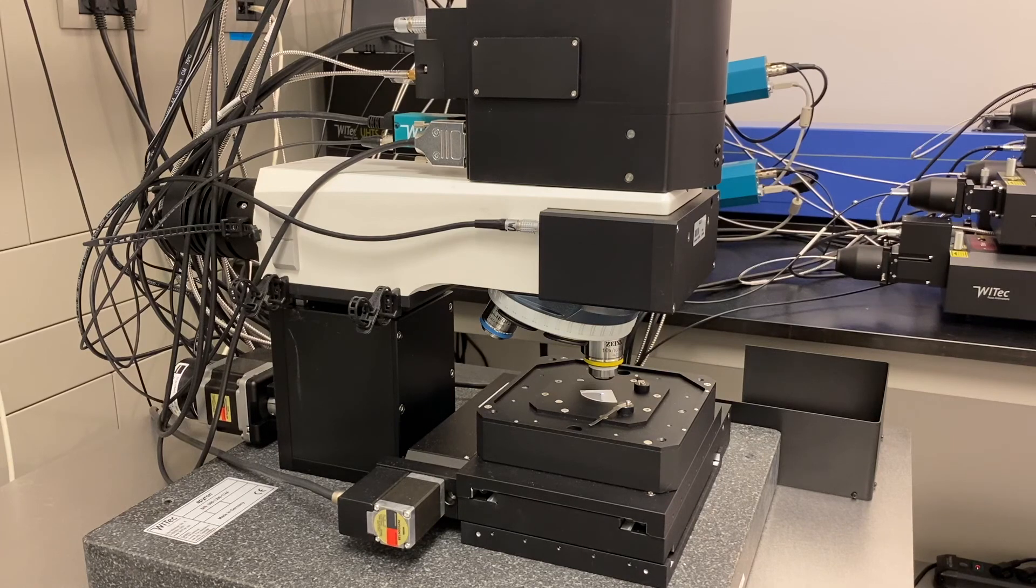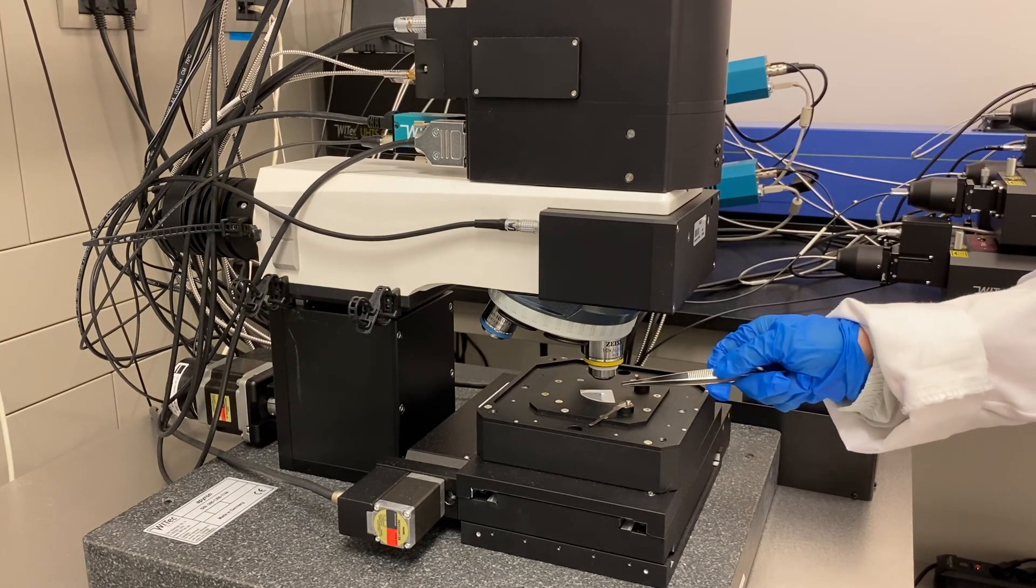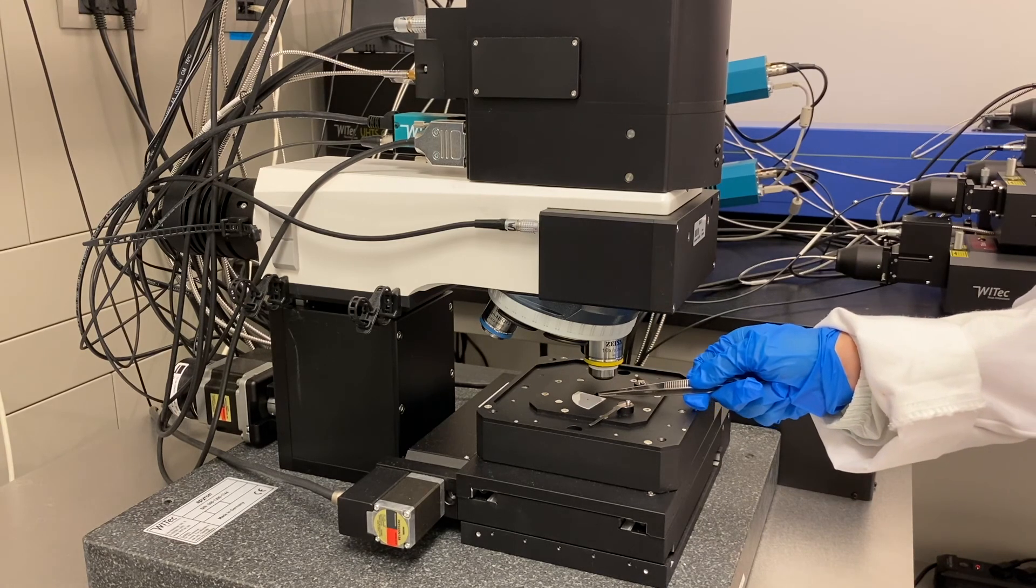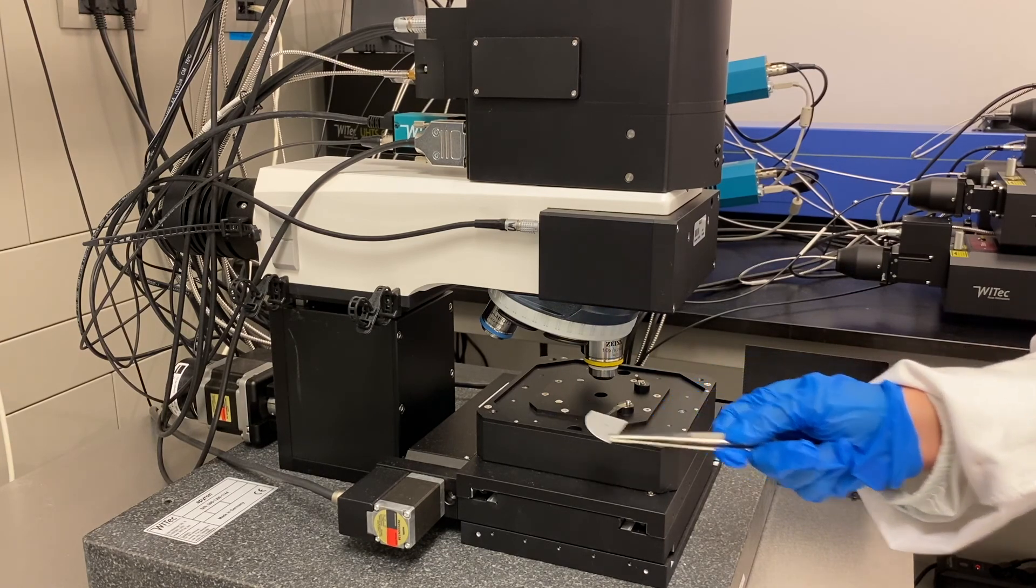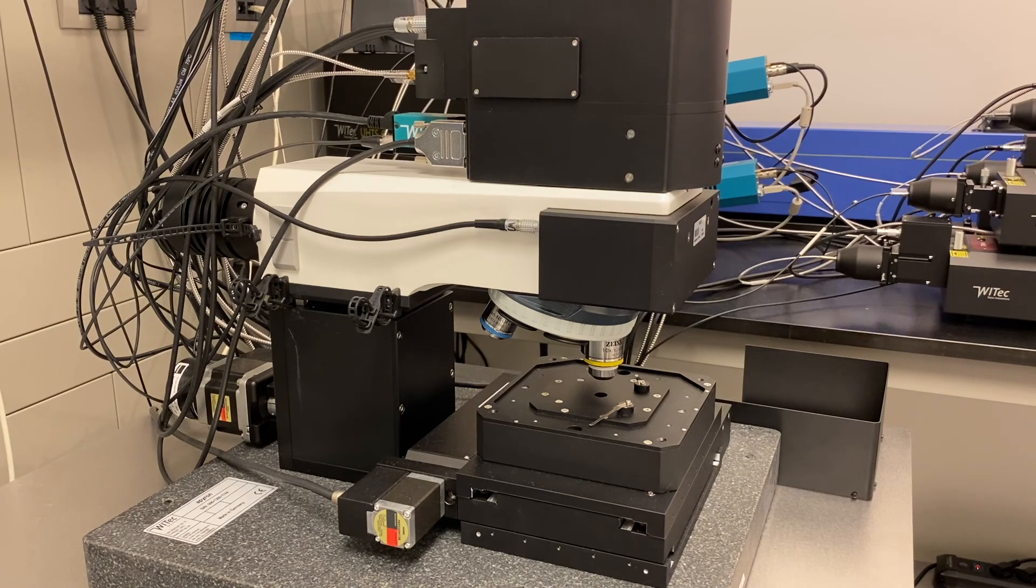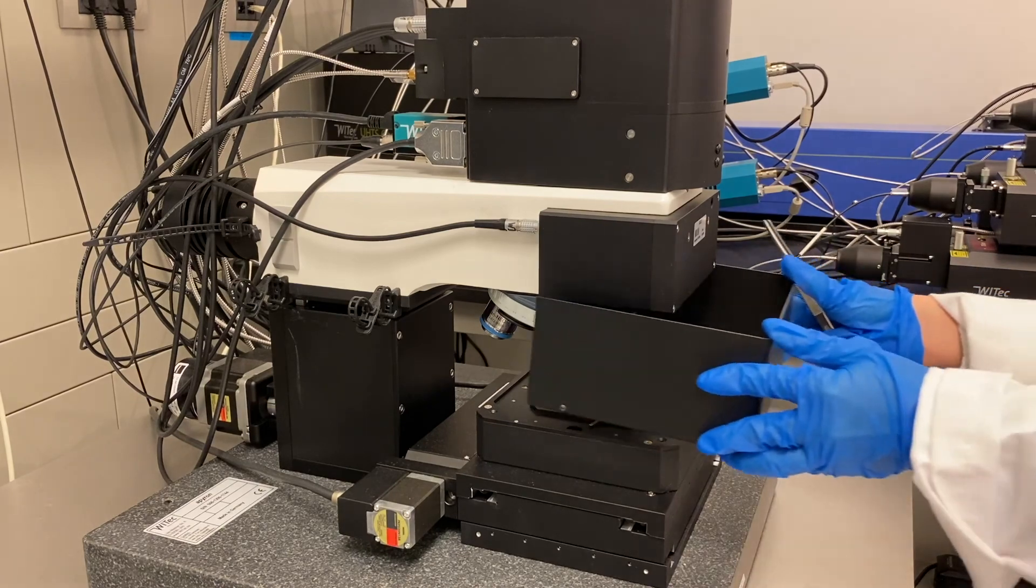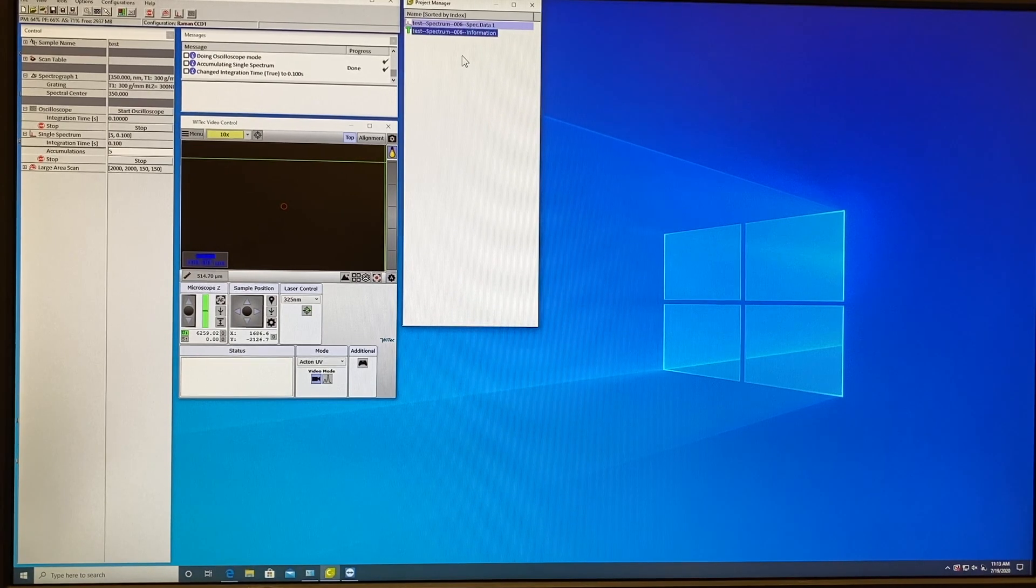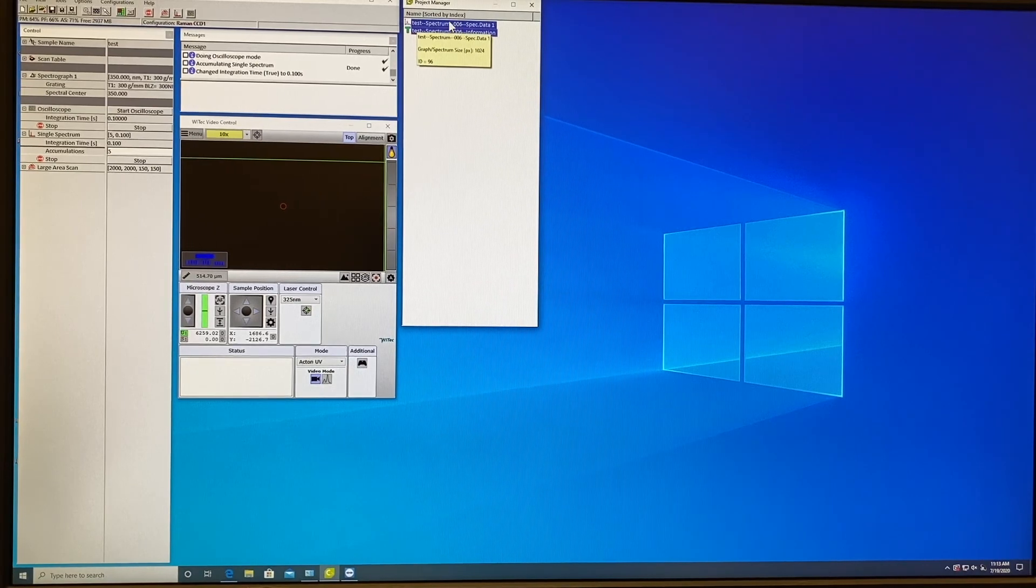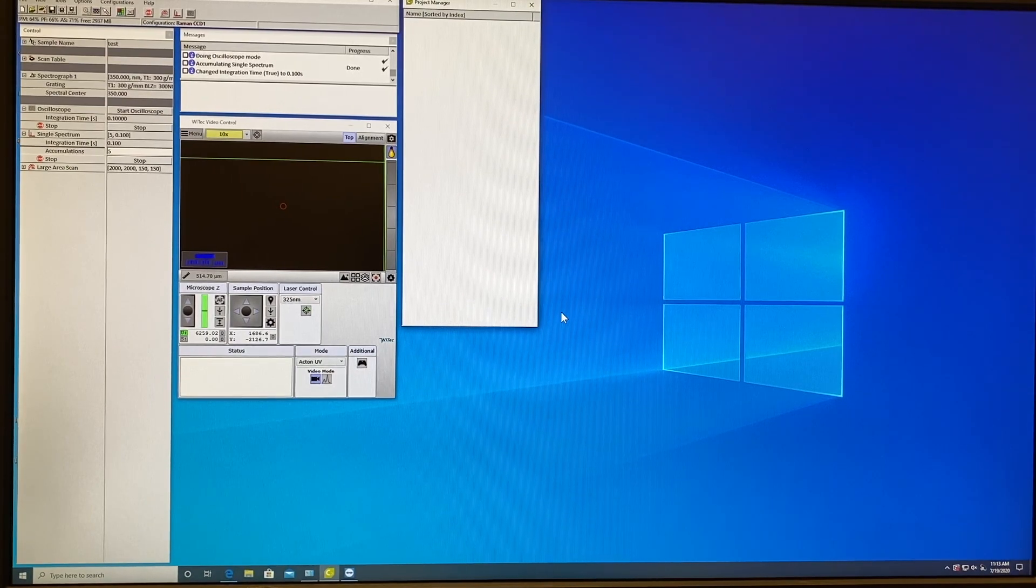Only after you can take the tweezers and remove your sample from the stage by pushing on the side. After that you can put back the safety lead. When you finish the measurement you always leave the program on. The only thing you have to do is empty your project manager after you save your project data. So you clean here by pressing Delete and that's it.